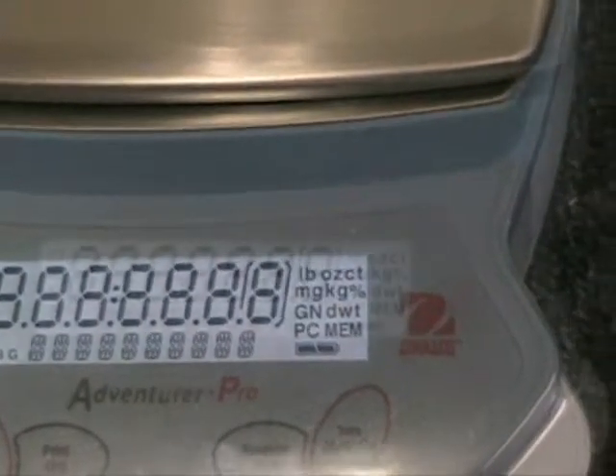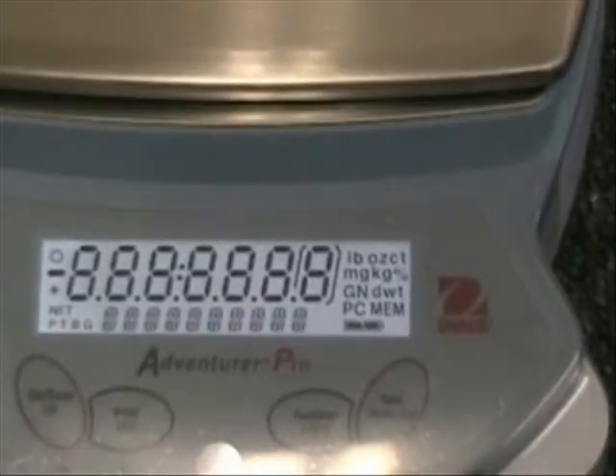Featuring easy-to-use four-button operation with intuitive interface, a new two-line brilliant backlit display, and multiple weighing units, the Adventurer Pro is the precision balance for all your needs.